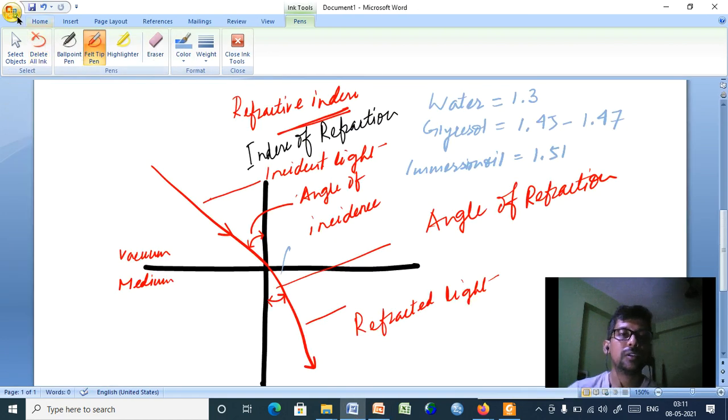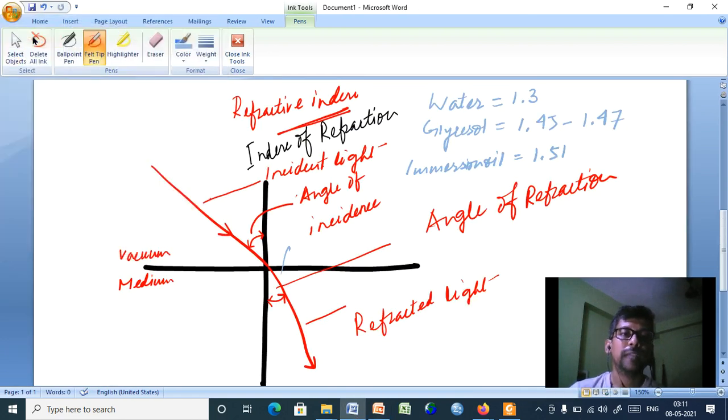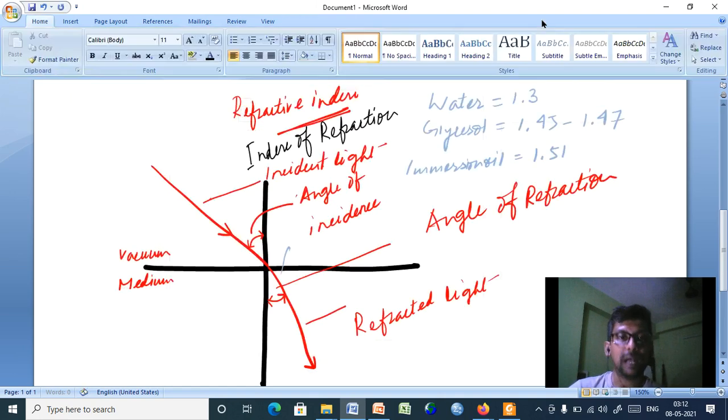These fluorescent compounds are very important and very attractive to reveal the presence of a type of compound.